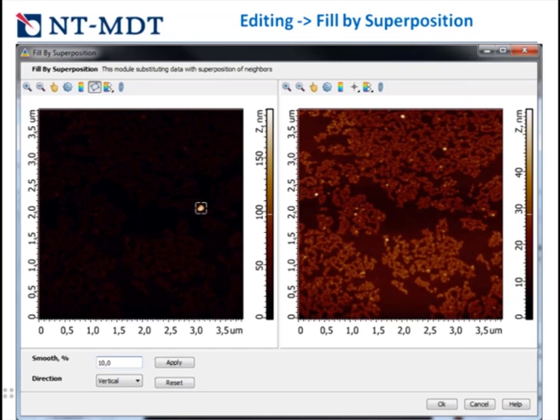Because finally you don't change the scientific data, you just change the way of representation. But anyway, you can use it or use other methods.